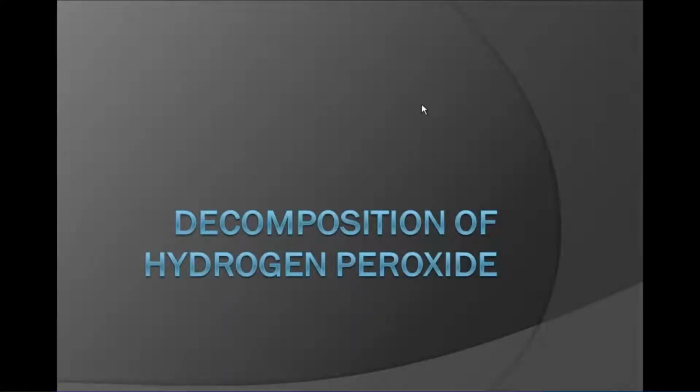Hey again, it's Mr. Lum, and in today's lesson we're going to be looking at the decomposition of hydrogen peroxide. Sometimes this experiment or lab is called elephant's toothpaste or monster foam or something like that. But we're going to take a little bit of a closer look into it.